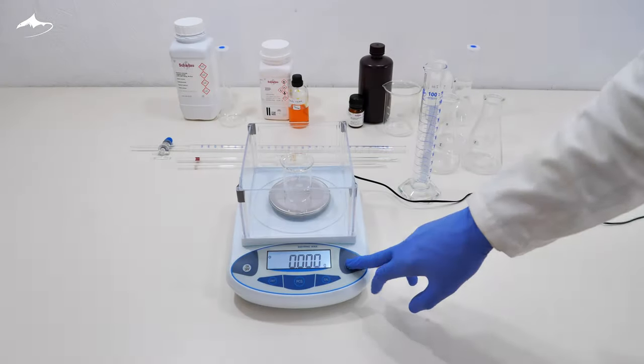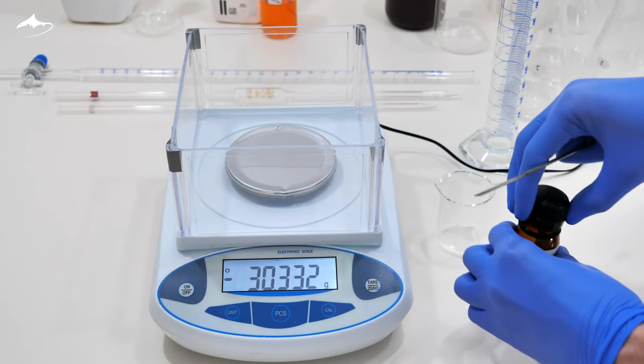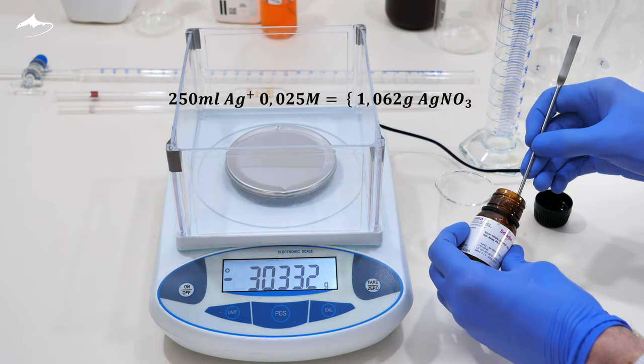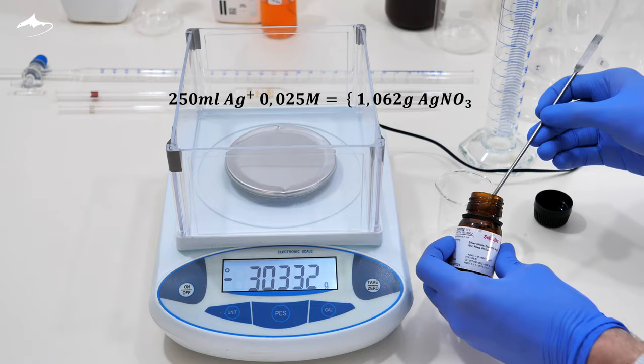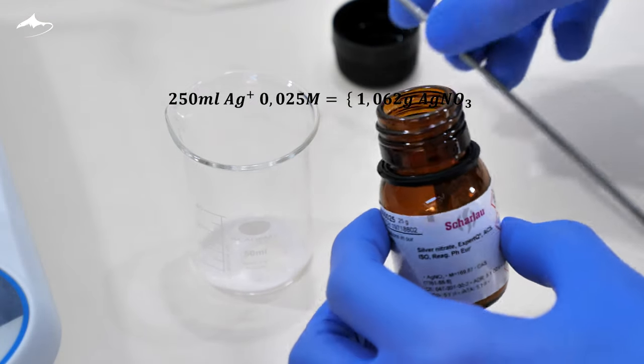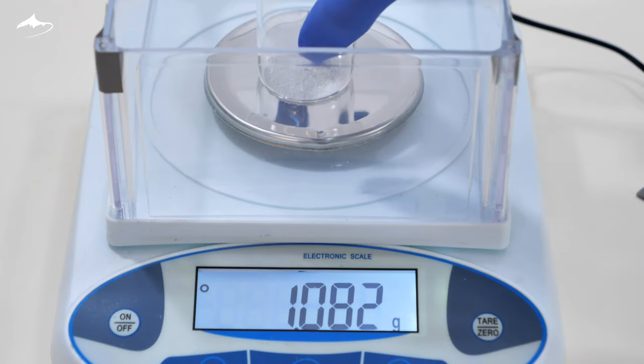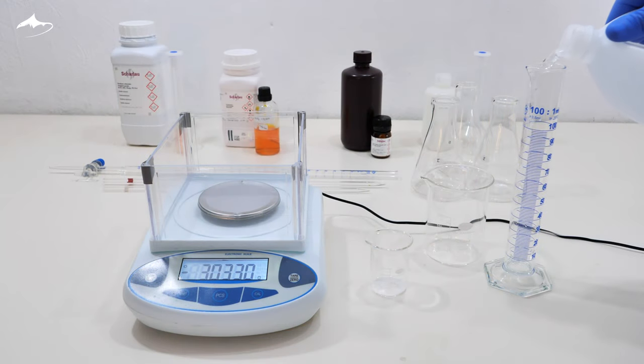Now, the last of the reagent solutions, the titrant solution. Analytical grade silver nitrate is used. In order to prepare 250 ml of silver nitrate 0.025 molar solution, approximately 1.06 grams of the nitrate needs to be weighed. Since I am going to standardize it afterwards, it is not necessary to use a volumetric flask, nor to weigh the exact amount, as before.